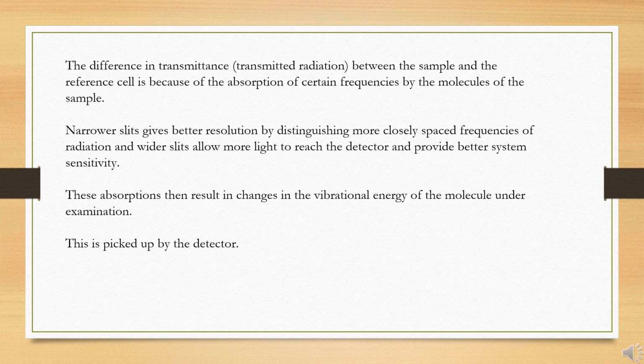This absorption then results in a change in the vibrational energy of the molecule under examination. This is picked up by the detector, which generates an electrical signal as a response.